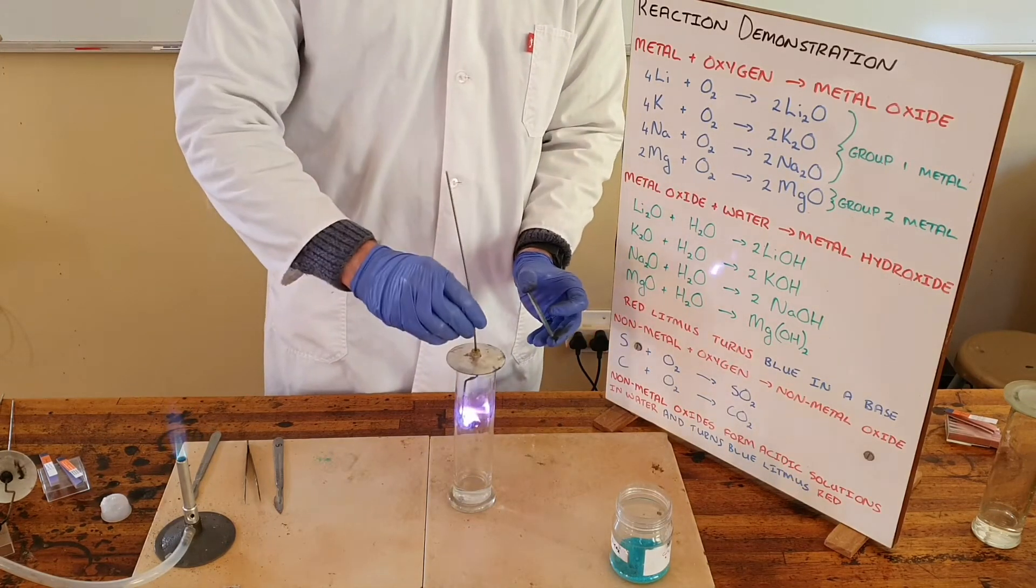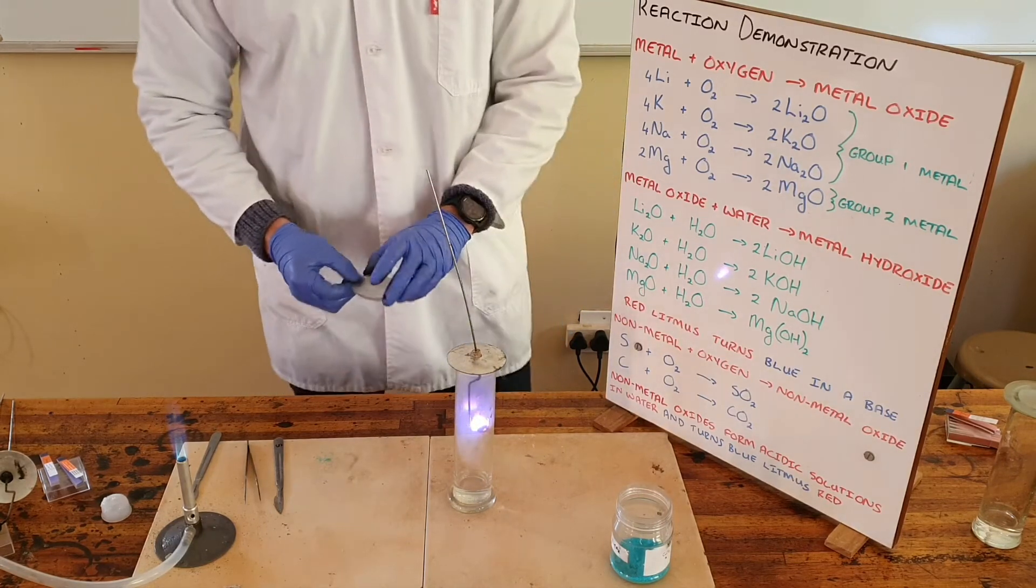We can now see when placed in pure oxygen that it burns a purple color.